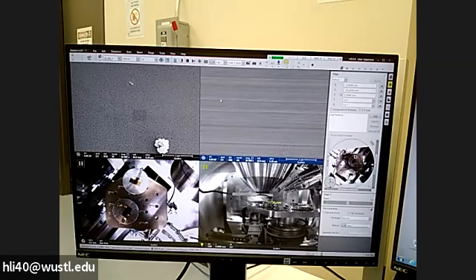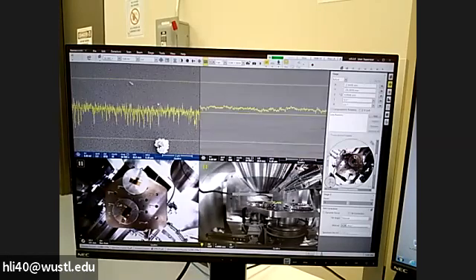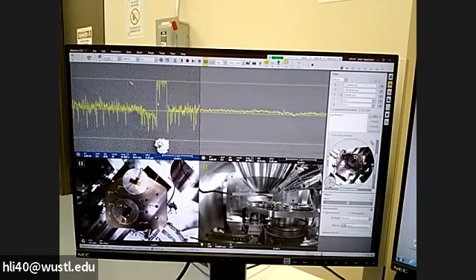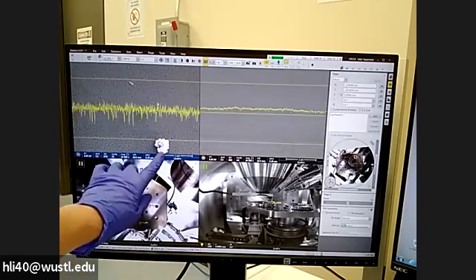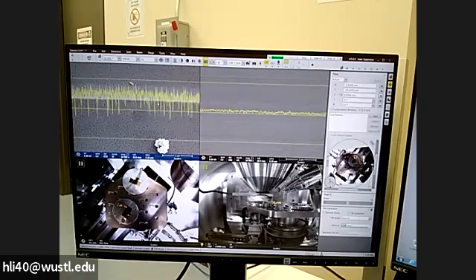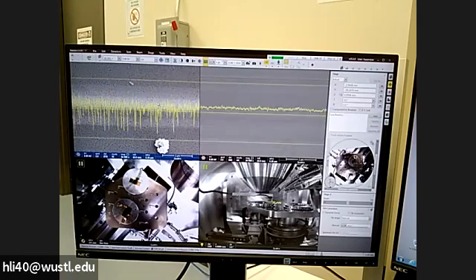The left image becomes much better. We can also put integration there. We can put 4 there if we like. You will see much better. And you can also check the video scope to make sure everything is still. Let's ignore the right image at the moment. If you do that, maybe we can change this a little bit higher because we are not focused on this particle. So if we look at the film, I want to make this higher, 6 counts, okay? This will look much better to me. I increase.